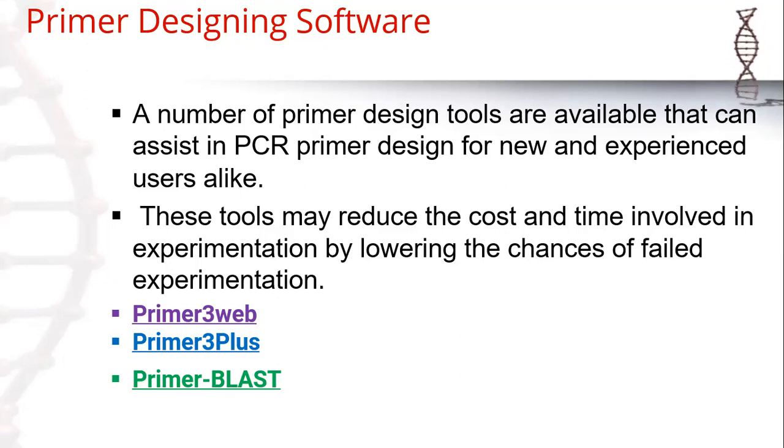Primer3 Web uses online servers, which can help and is very easy to use for new users. And Primer3 Plus is also an advanced form of Primer3 software. And Primer-BLAST is also a very easy web-based tool that can easily be used for primer designing. Primer3 is also available to download, and we can also download the library so that it can help to design the primers without having an internet facility.